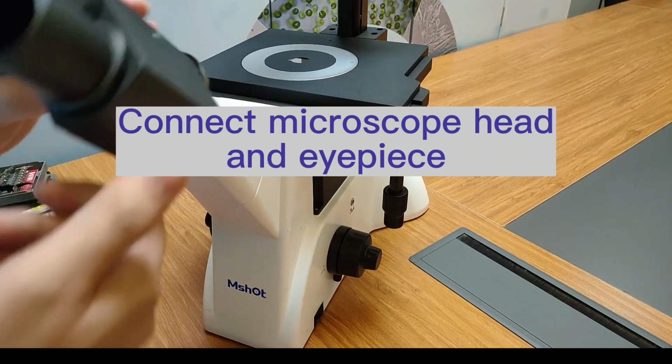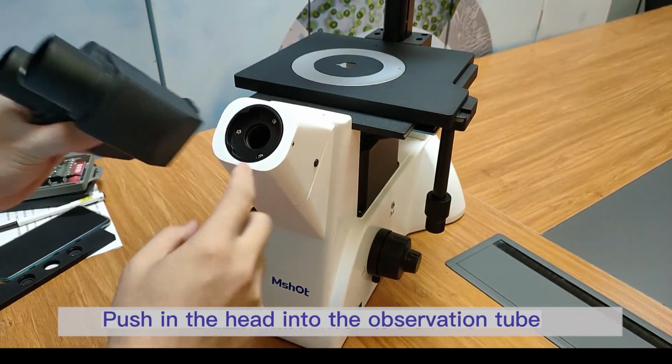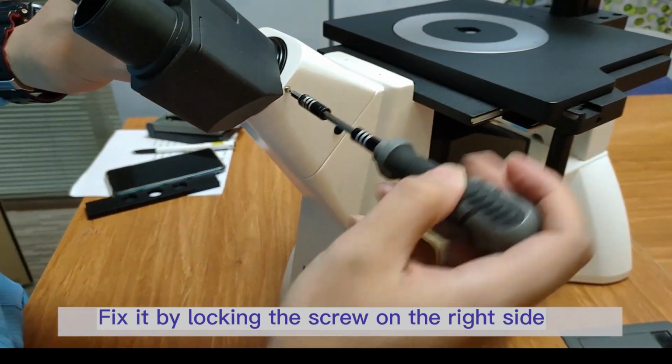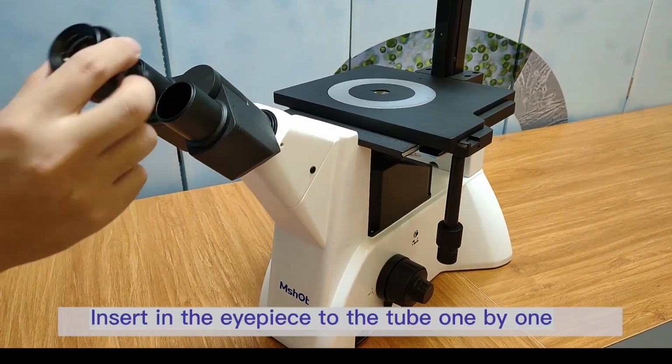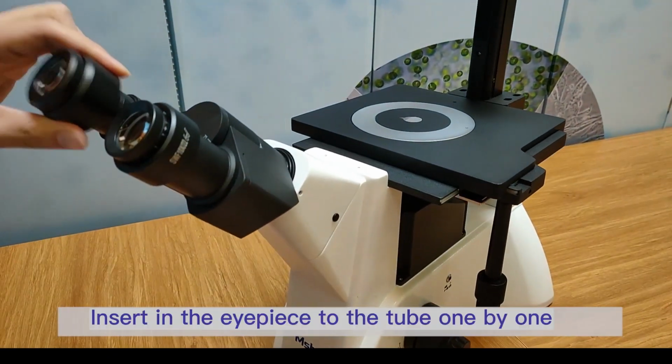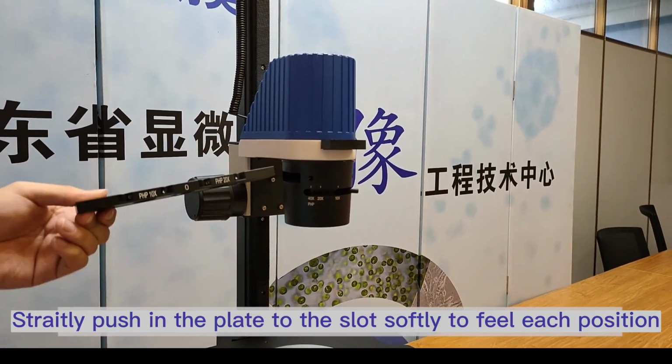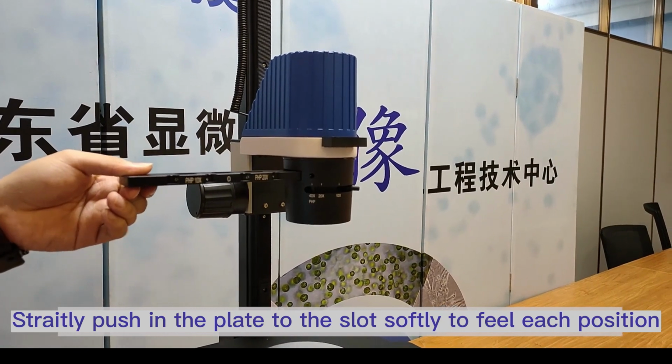Connect microscope head and eyepiece. Push the head into the observation tube. Fix it by locking the screw on the right side. Insert the eyepieces into the tube one by one. Install phase contrast plate. Straightly push the plate into the slot softly to feel each position.